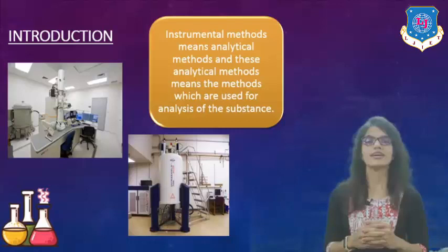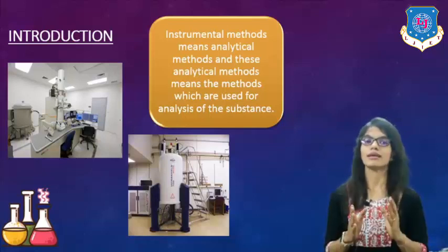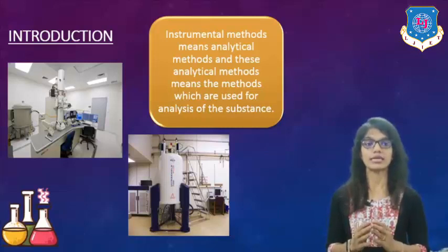So here, as you can see, SEM is there, NMR is there, right? Likewise, we will study NMR spectroscopy, scanning electron microscope, transmission electron microscope, what is the meaning of mass spectrometry, and what you understand by EDXRF.